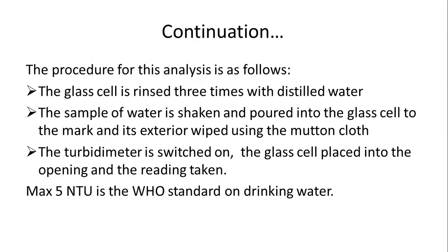Yeah, so the procedure for this analysis is as follows. You are supposed to check the glass cell and rinse it 3 times with distilled water. This is common for all water tests that you'll be conducting in the lab. The apparatus you have, you're always supposed to rinse them 3 times with distilled water.